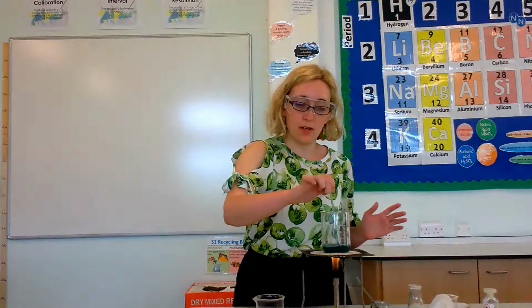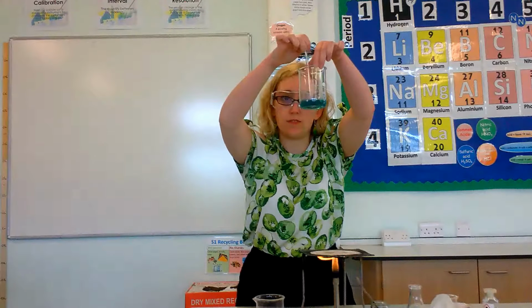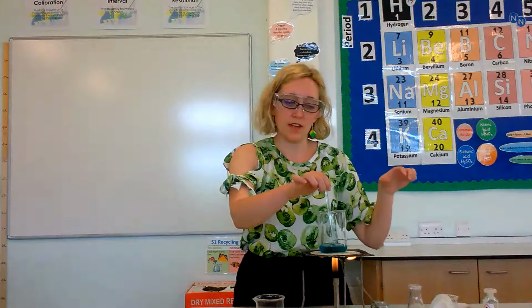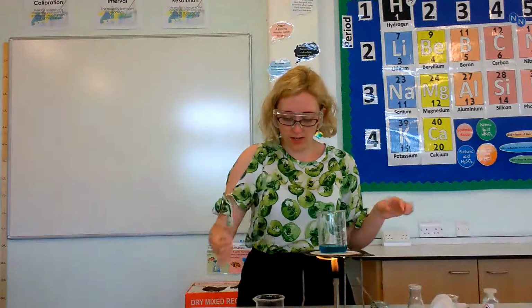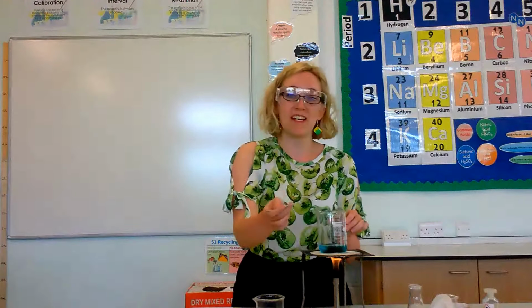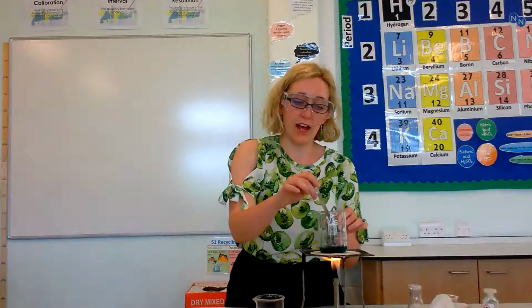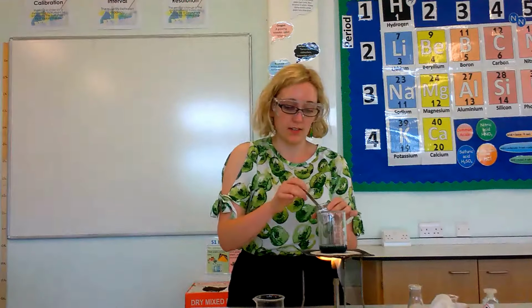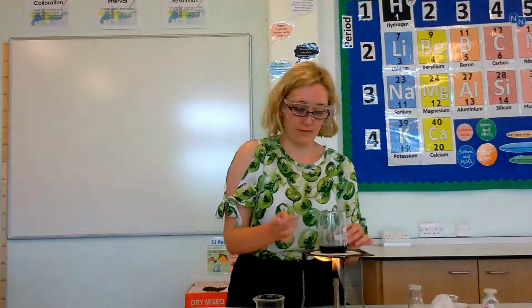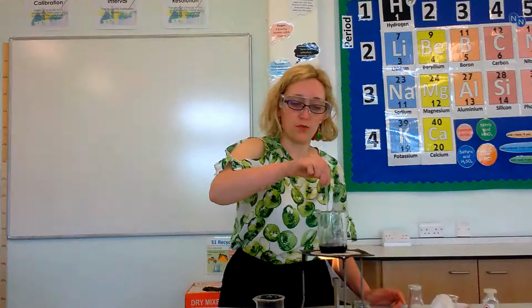Now I'm starting to form my blue-green colour. You might be able to see it is now sort of a very nice aquamarine turquoise. Sometimes it's a slightly different colour, it just depends how much you've got in there. When you've got that blue-green colour, you just keep adding your copper oxide. We want the copper oxide to be in excess, is what it's called, and that means that we've got unreacted copper oxide, but we haven't necessarily got any unreacted sulfuric acid. So I'm just going to pop loads in and keep stirring. It should have reacted all the acid by now.